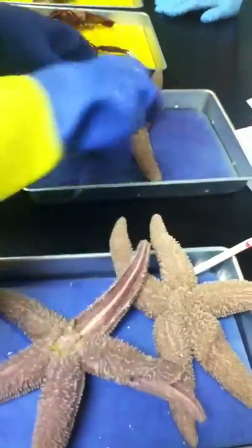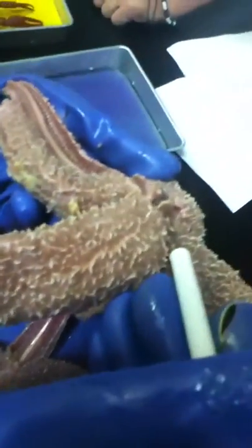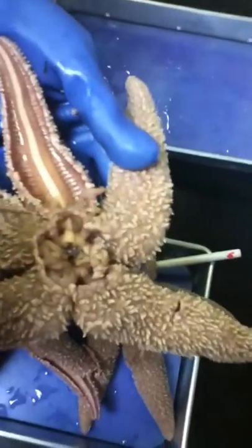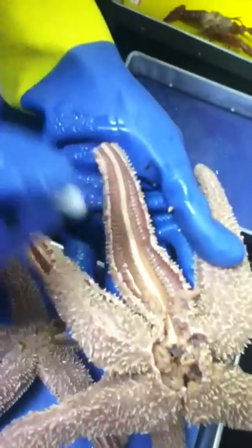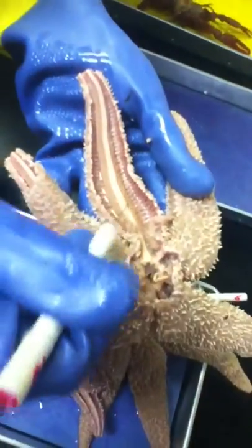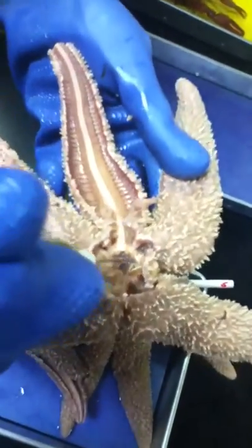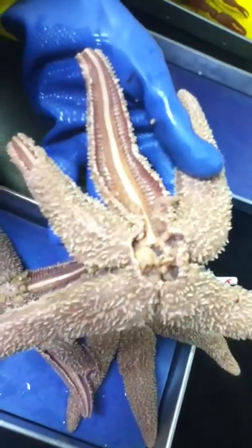And then the canals. Coming from the madreporite, what's this first canal here? Stone canal. And then there's still a part of the stomach here. The one in the middle ring, because it's a circle — down inside of this, what are the canals called? Radial canals. And then the water goes into the ampulla and out the tube feet. So the canals are stone, ring, and radial.